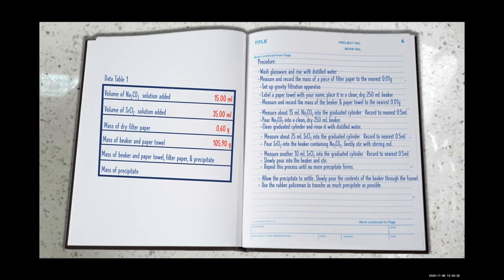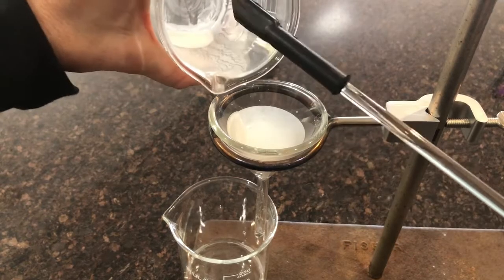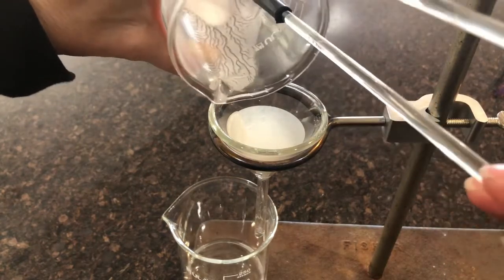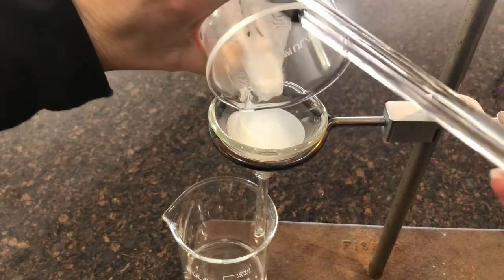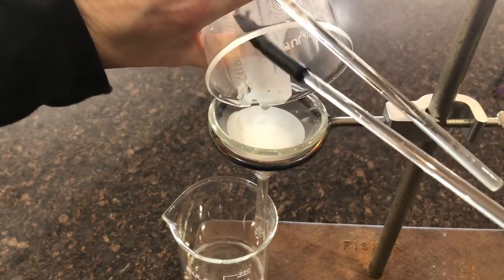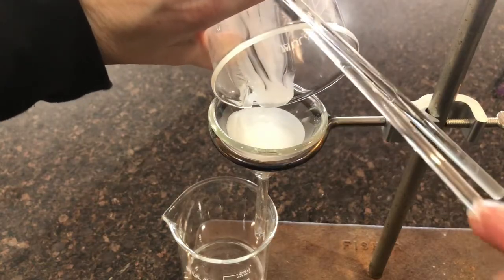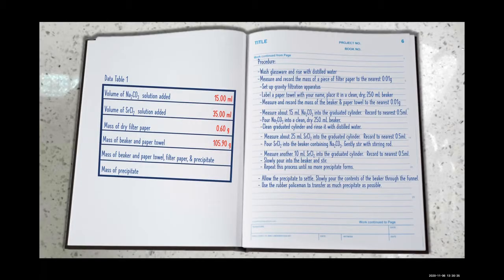Using a rubber policeman, we will transfer as much precipitate as possible. Using the wash bottle, we're going to rinse the rubber policeman, beaker, and the stirring rod. Pour the contents through the funnel and repeat it several times.